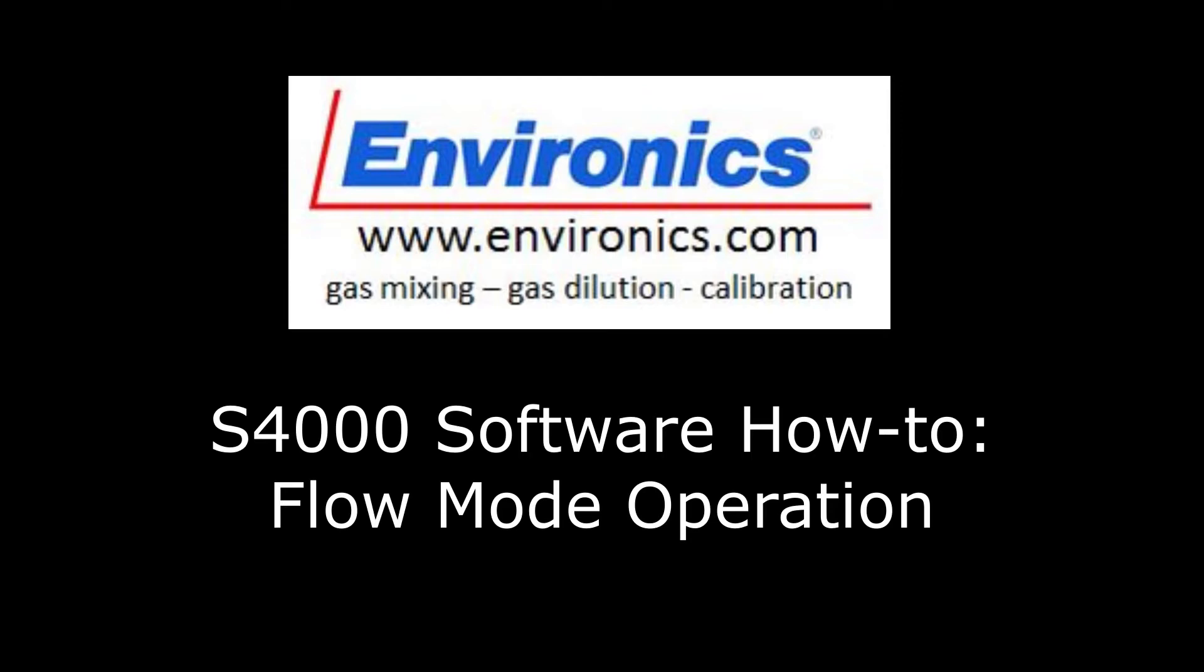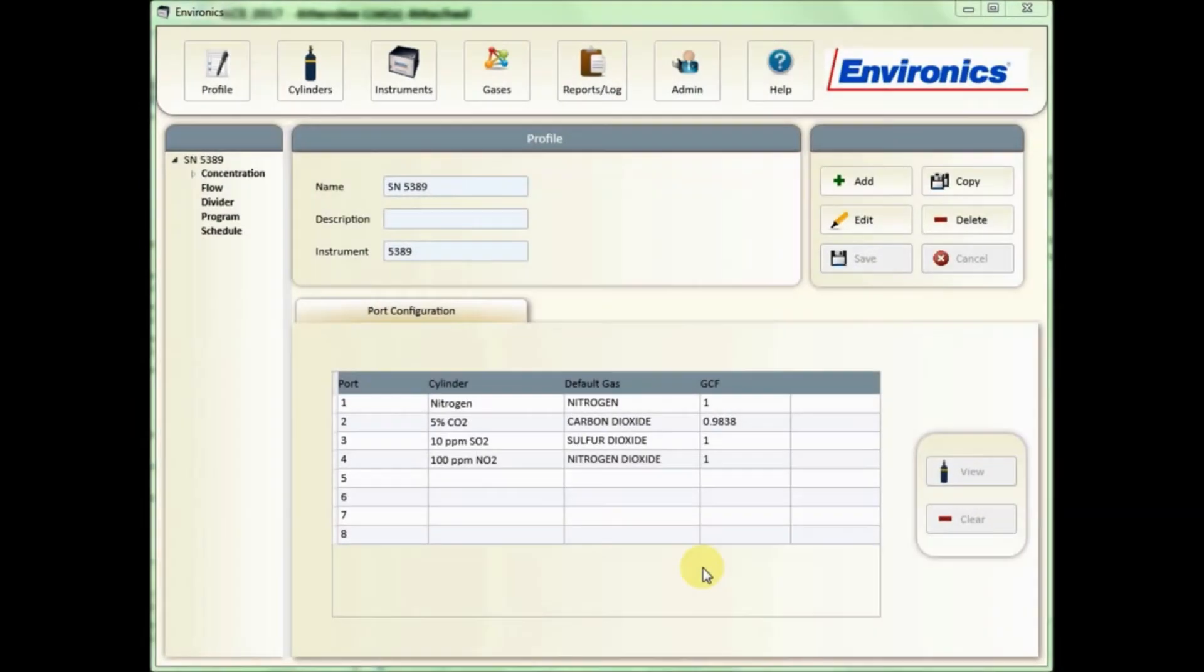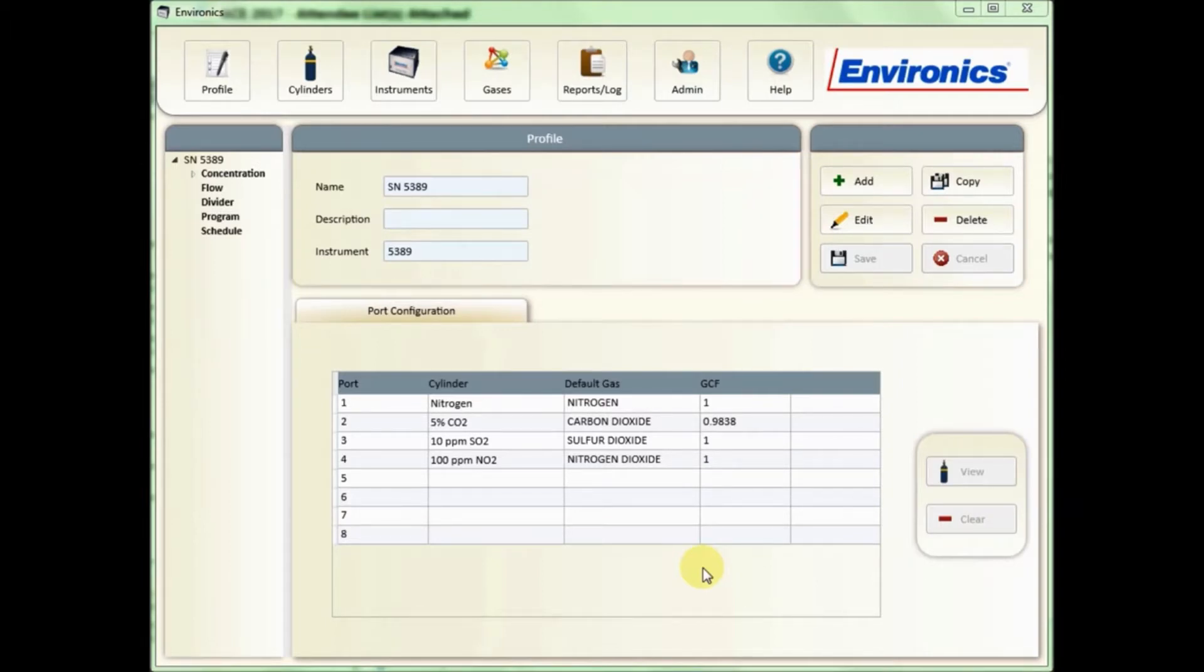Today's video we're going to look at creating flow modes with your Windows 7, 8, 10, Environics Series 4040 and 4020 software. Last week we looked at how to create concentration modes and edit them. Flow modes are very much the same, so today we're going to take a quick look at that.